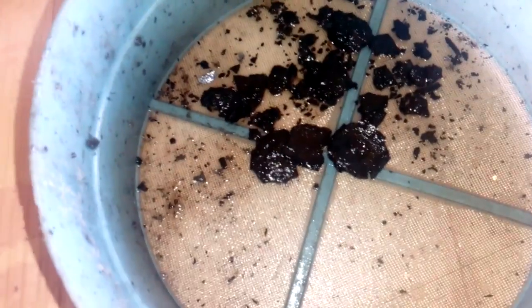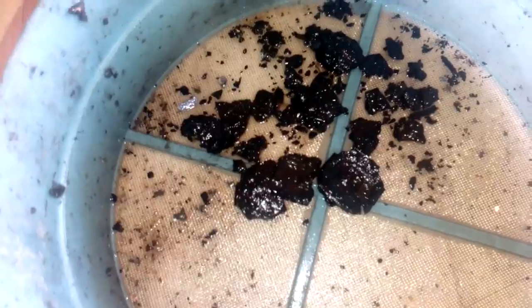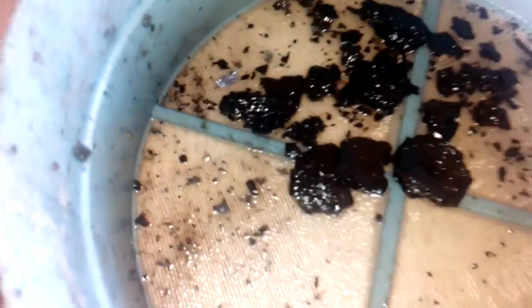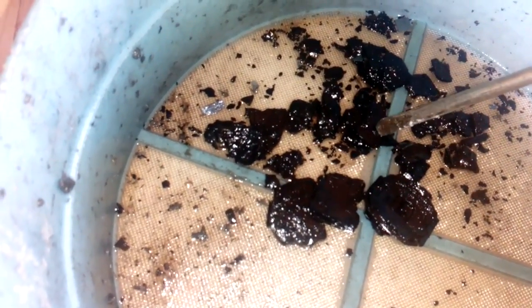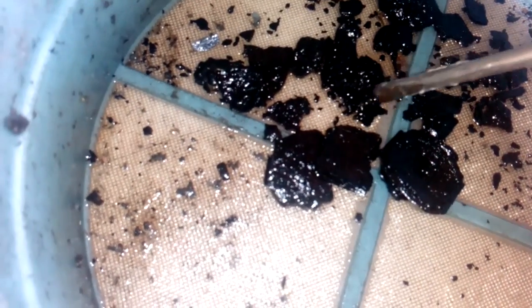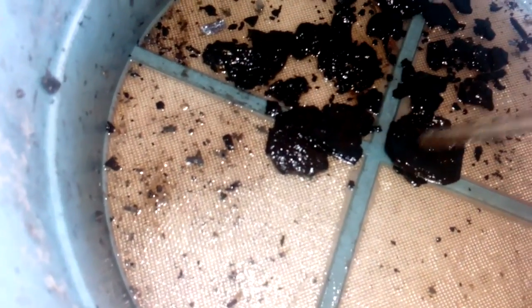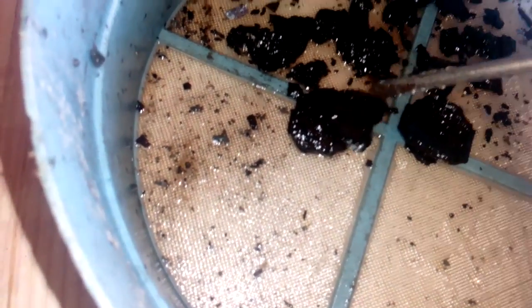After I boiled that chip in the evaporated car battery acid - this is after two hours of boiling - this is what I have. And partially the material is dissolved. You see? It's kind of crunchy. Look at that inside - here I got some gold bonding wire. But it's not totally dissolved.